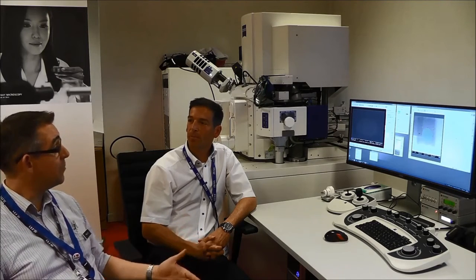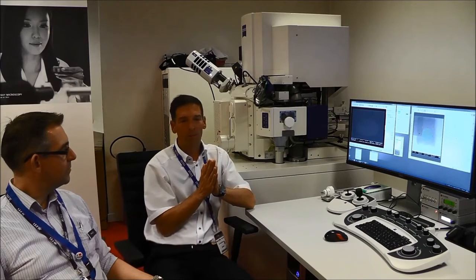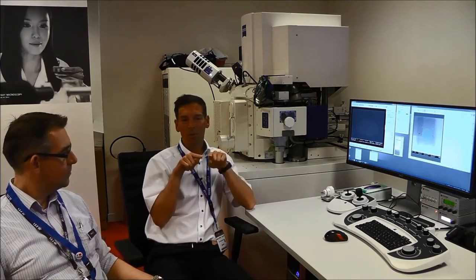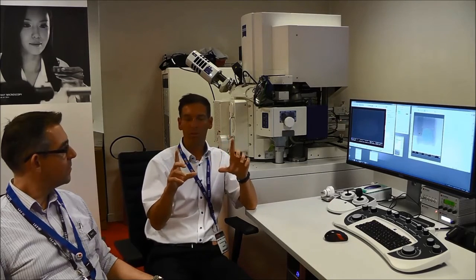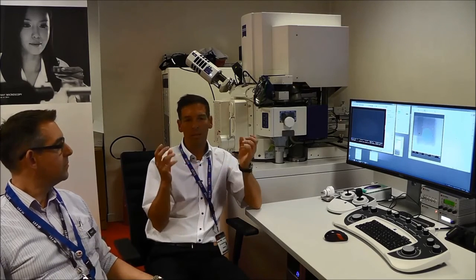One of the best-known features of focused ion beam systems is their 3D capability. Is that still a big selling point for Zeiss? 3D tomography is a focus application for Zeiss — the CrossBeam instrument is a 3D tool. We have other 3D imaging techniques like X-ray microscopes in our portfolio, and we combine them using our correlative workflows. Specifically for FIB-SEM tomography, it is fairly easy to achieve nice resolution in X and Y — the imaging plane of the SEM — but more difficult to achieve the same quality in the Z direction, which is the direction in which the focused ion beam advances. We have been developing solutions that finally achieve an isotropic voxel of down to less than 3 nanometers in size.